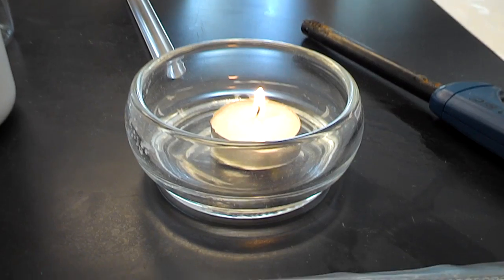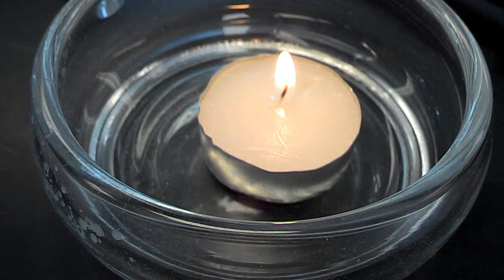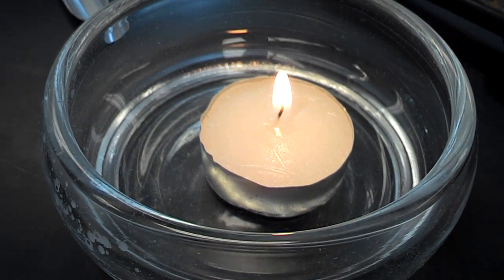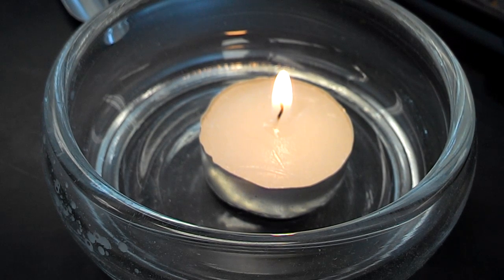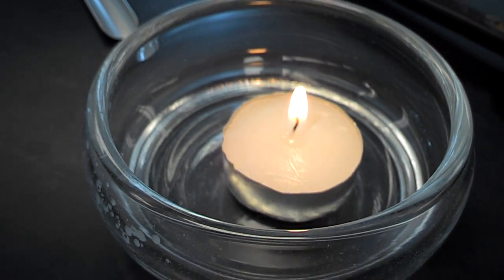But the second thing that might not be as noticeable on camera is that the wax, which used to be solid, is now turning to a liquid. So there's a few things going on here. When you record your results, be sure to include both of those observations. When you're finished, be sure to blow out the candle.